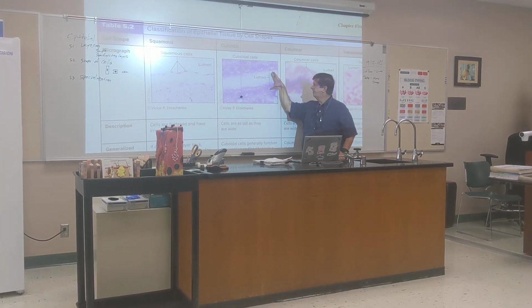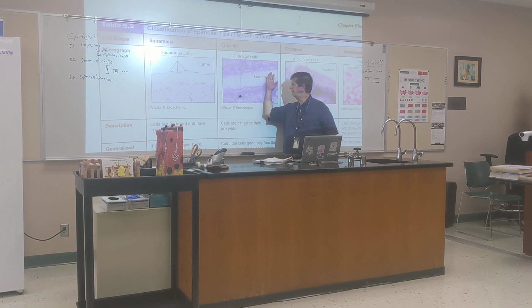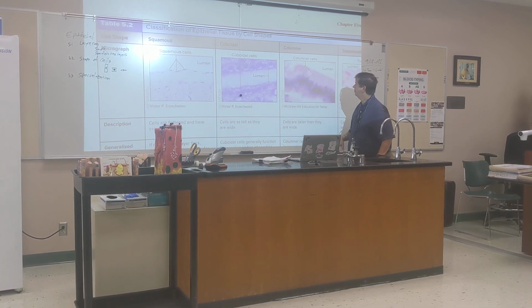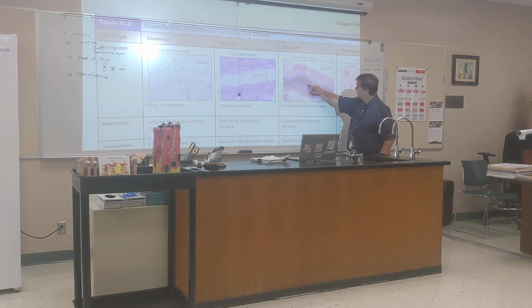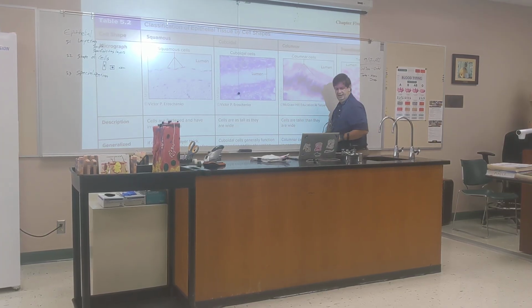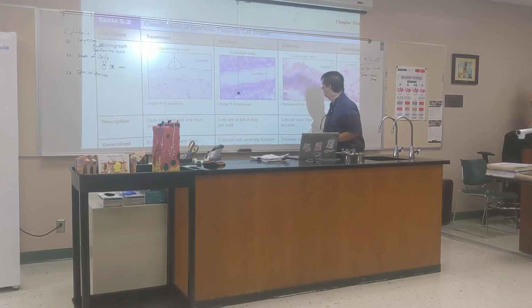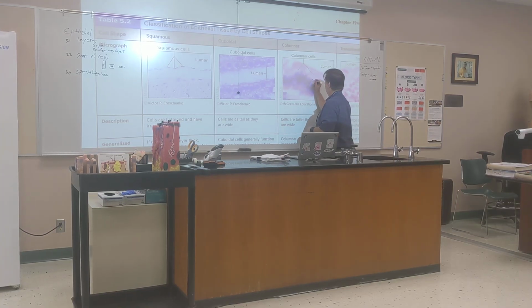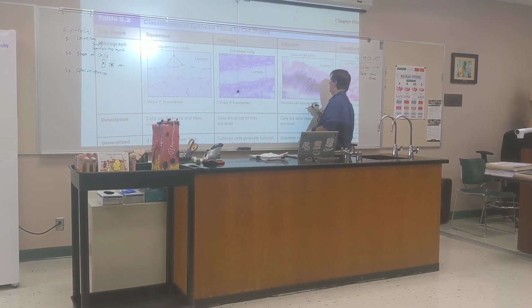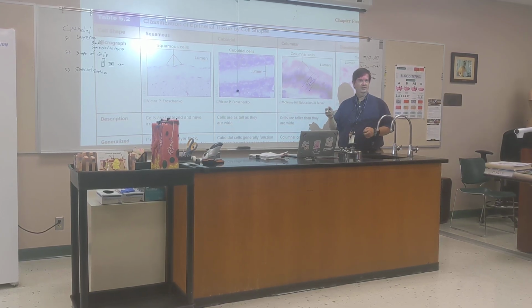This is a piece of kidney tubule cut lengthwise, I'm sure of it, because that's the best place to find cuboidal. This, do you see tall, thin cells with the nucleus squeezed in between in kind of an oval? Let's trace the outline to make it easier. So we've got a nucleus, and the cell is shaped like that. We've got another nucleus and a cell shaped like that. These are columnar, you agree?